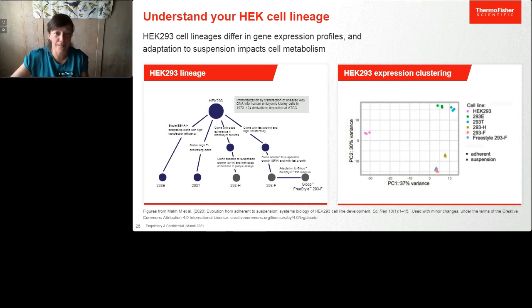I think the answer is really simple, and we all know that working with cells, high-performing cells have different nutritional needs, because every clone, every cell is unique. Sometimes I don't know the full history of my cell bank, so we cannot predict how they perform best and where they perform best. And this really applies to most cell types used in biomanufacturing.